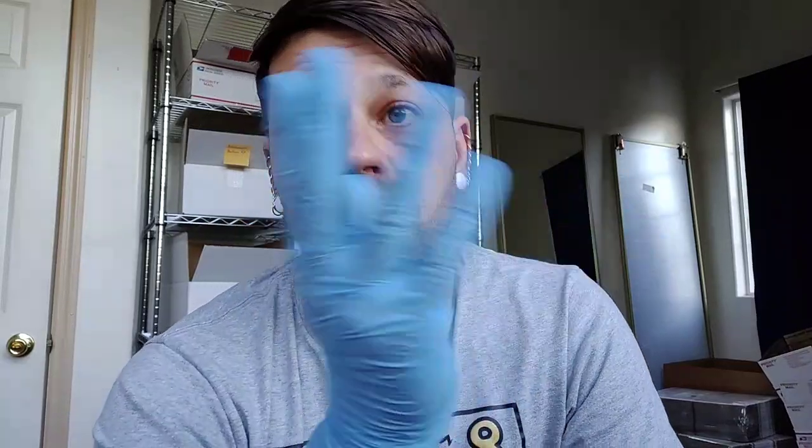So if you want to test out the effect of a certain gene on these HEK293 cells, you can do it. And you can even get them GFP tagged and other cool stuff. So it's a really cool thing that I like to use. That's where the follistatin is from. It's from GenScript. Well, maybe I shouldn't have said that. Hopefully GenScript isn't listening. But yeah, it's from GenScript.